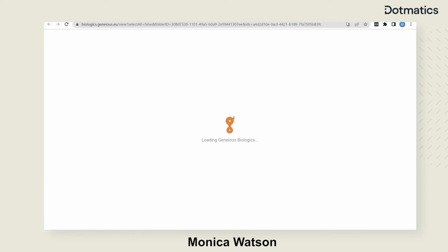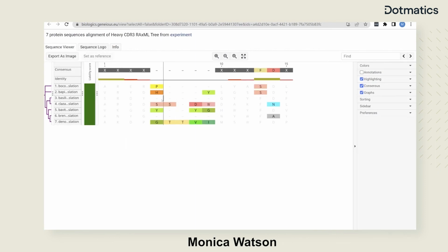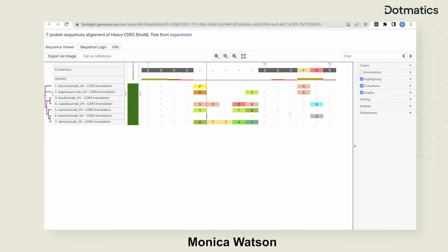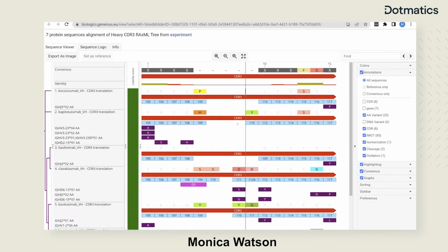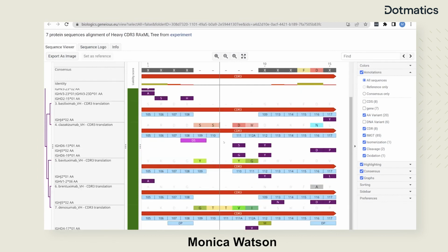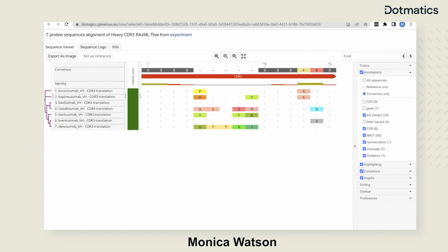So we've gone from these annotated sequences, added our bioassay data, and now we have this alignment. And you can see how these sequences are related to one another, and the CDR3 that is associated with each of those sequences. You can choose to annotate a variety of different elements of your sequences. It gets kind of messy the more annotations you have, obviously, but if you're interested in all of the information associated with the sequence, you might want to do this. But let's say I just want the consensus, and it gives you information on how variable the sequences you aligned are at each position in this region.